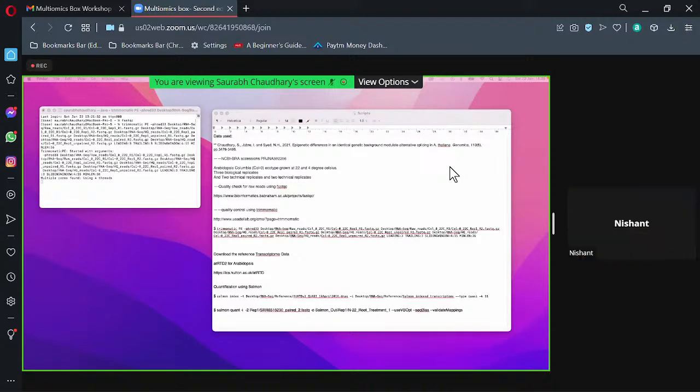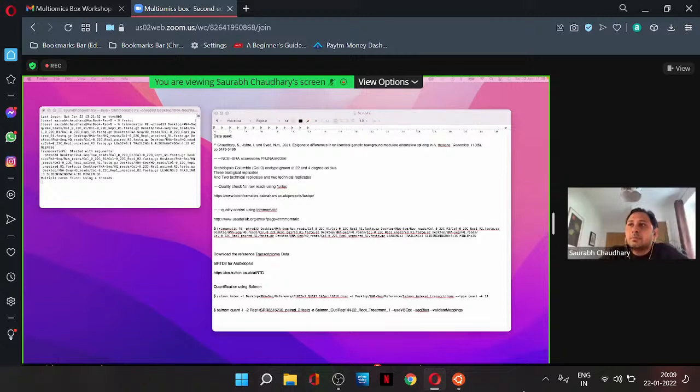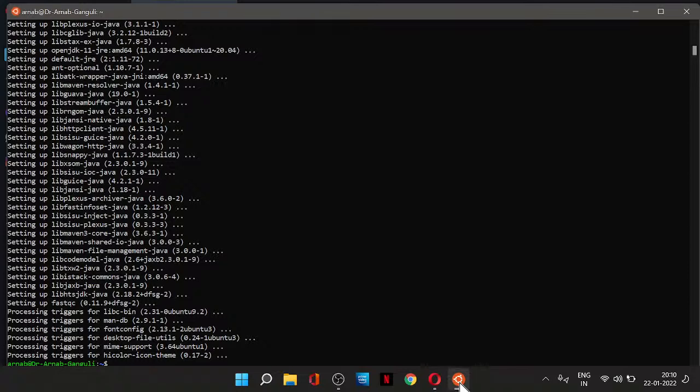Sir, so the purpose of Trimmomatic will be doing a quality check, or for the mapped reads, paired reads as well? No, it's not about the mapping reads. It's just a quality check. So your raw reads, which come from the sequencing or you download from the SRA, are not good quality reads.